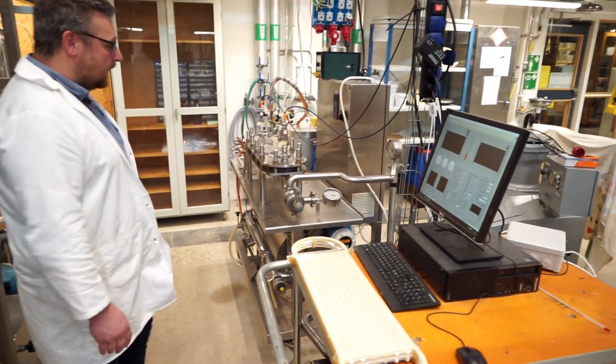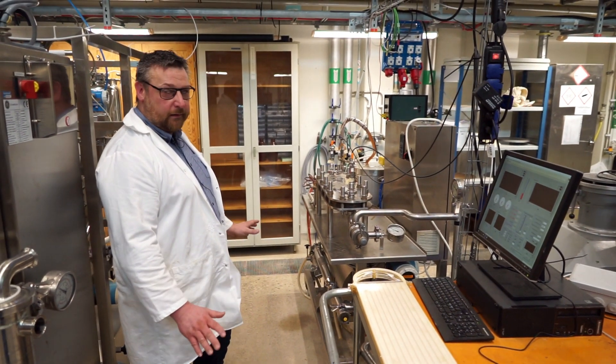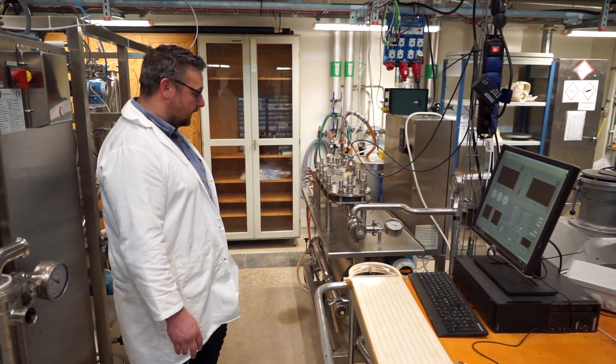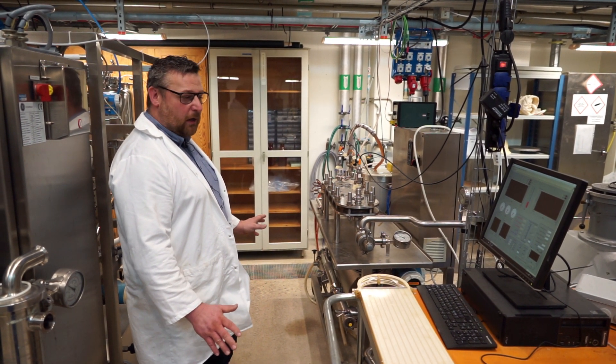This is our small pilot membrane filtration equipment that we use when we are doing a little bit more upscaled work.